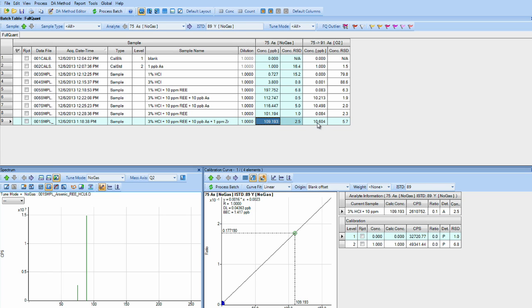However, in our oxygen mass shift mode from arsenic to 91, we get great correlation just as we had before there was any arsenic in the sample of 10 PPB arsenic.